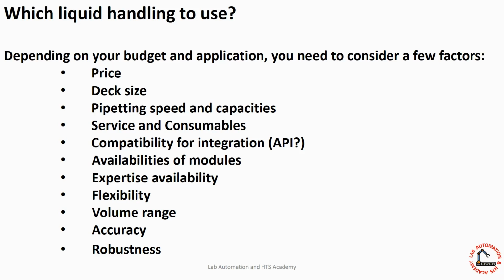And the other factor is, okay, if I want to do a whole workflow, for example, the whole PCR, RT-PCR workflow, or COVID testing on the same robot, then you have to answer the question, is it compatible for integration? What that means is you want to check if the modules, those devices, those instruments exist for that platform. These instruments and devices are usually built by third-party companies. And these third-party companies don't build them for all robots. They just build them for the best seller. So that's something that you need to remember.